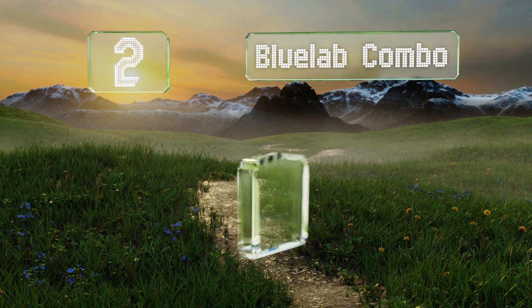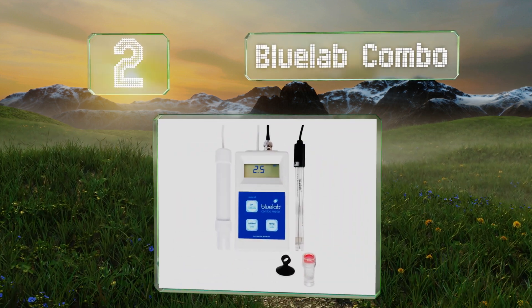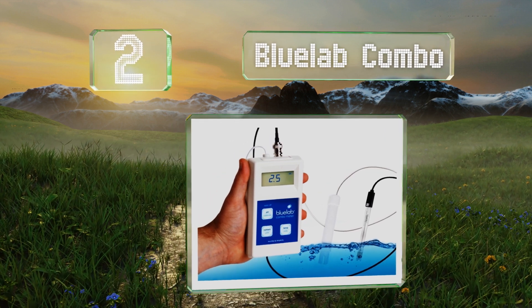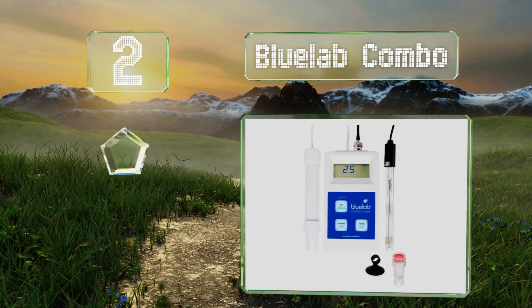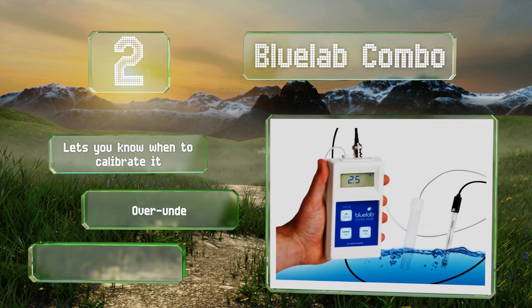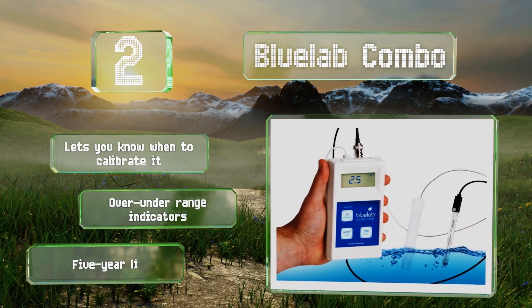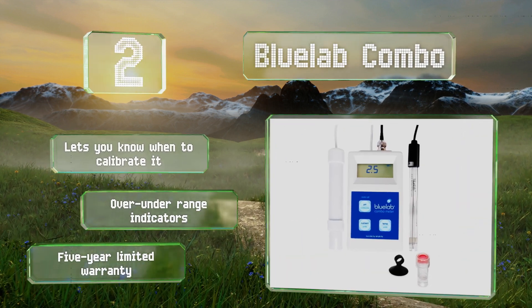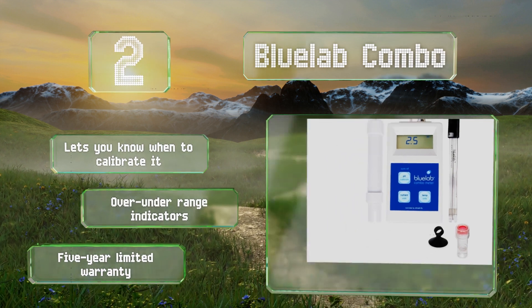At number two, the Bluelab Combo may be overkill for home use but it's invaluable in commercial settings. It has a replaceable dual junction probe and measures every important water variable for plant growth and seed germination. An auto-off feature ensures you don't waste the batteries. It lets you know when to recalibrate and features over/under range indicators. It's backed by a five-year limited warranty.